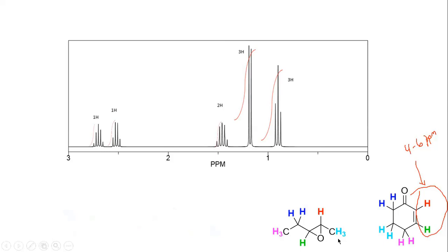Which signals do you think are going to be the furthest downfield? The one by the oxygen. The ones here? Yeah, this one and this one? You're right.